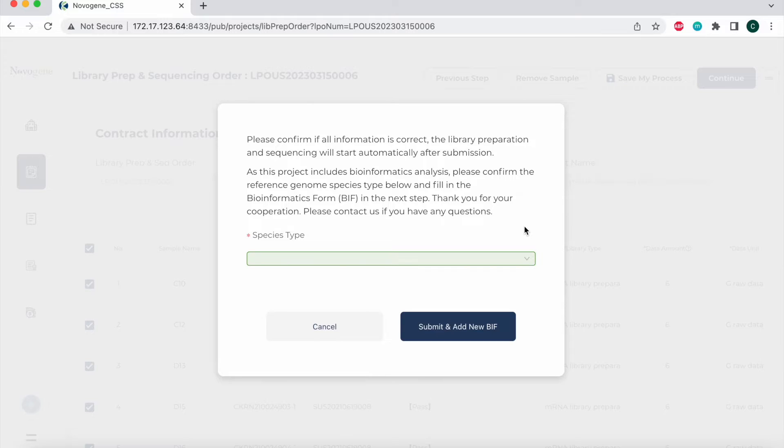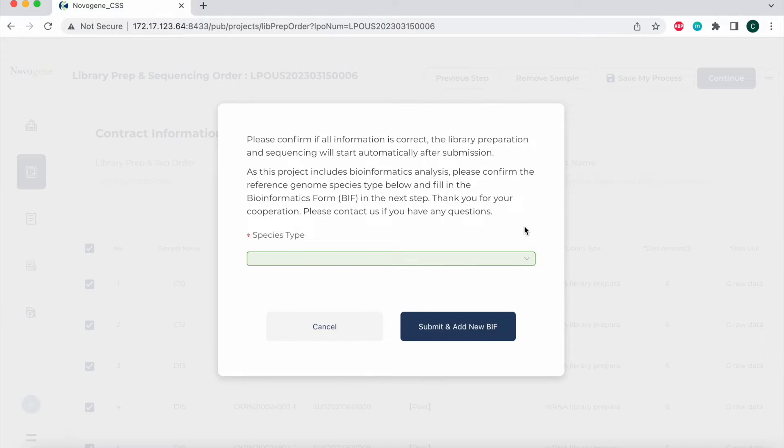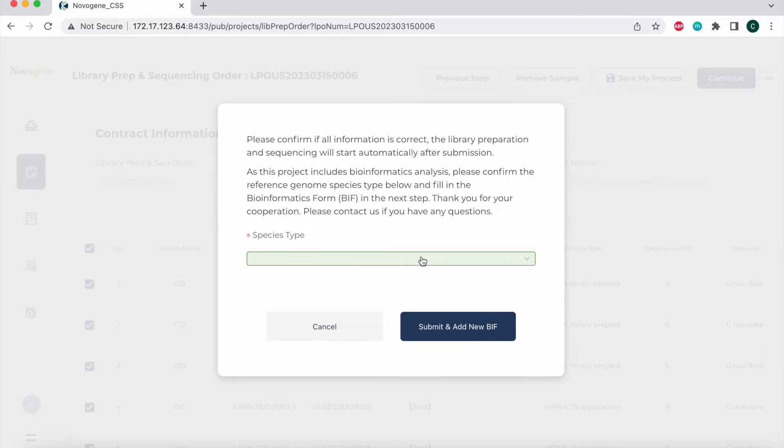After you complete the library preparation and sequencing order, a pop-up window like this will show up if your project does include bioinformatics analysis. You can choose the desired species type and select submit and add new BIF to access the bioinformatics page.